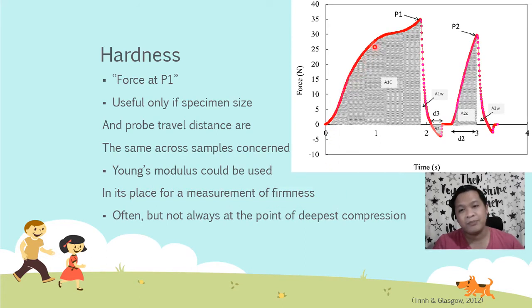So, basically, ang sinasabi nito is, if you're gonna compress it, let's say, to 50% its original size, kapag mas malaking force yung kailangan mo para makompress siya ng ganon, then technically, mas hard siya. Okay?